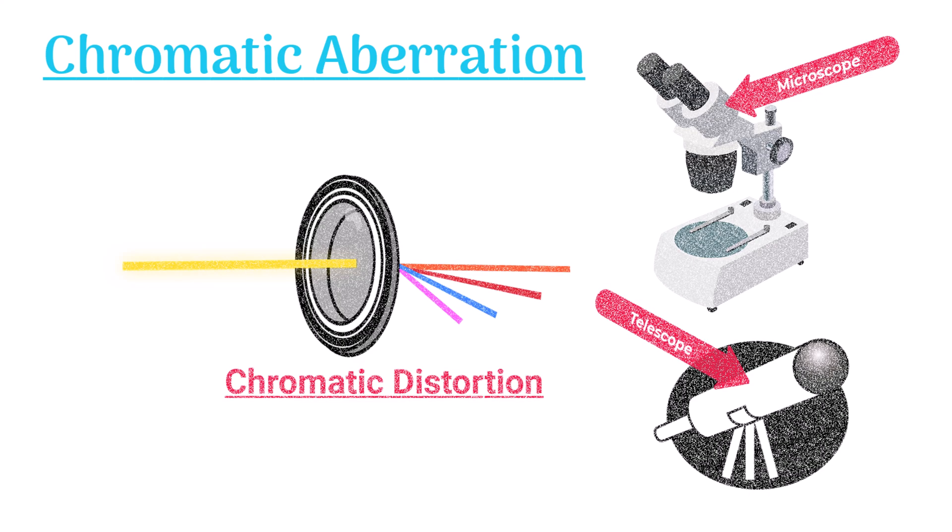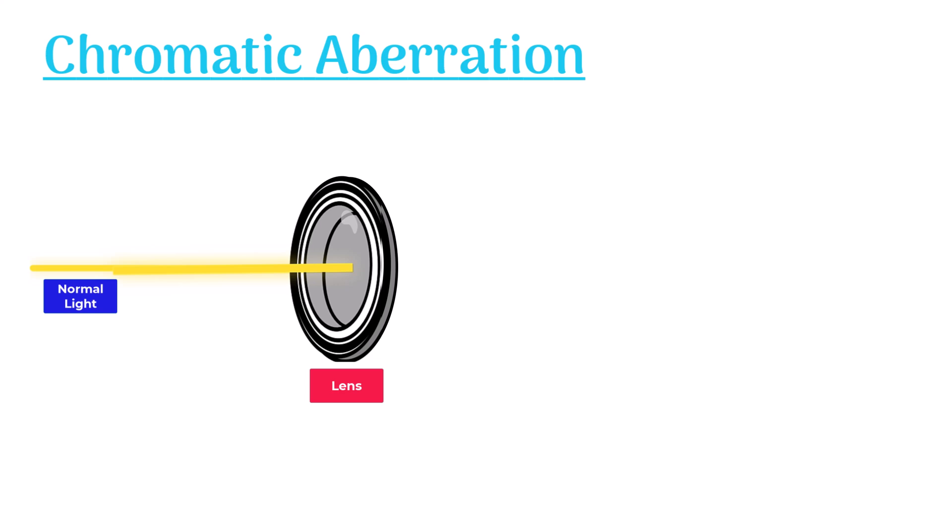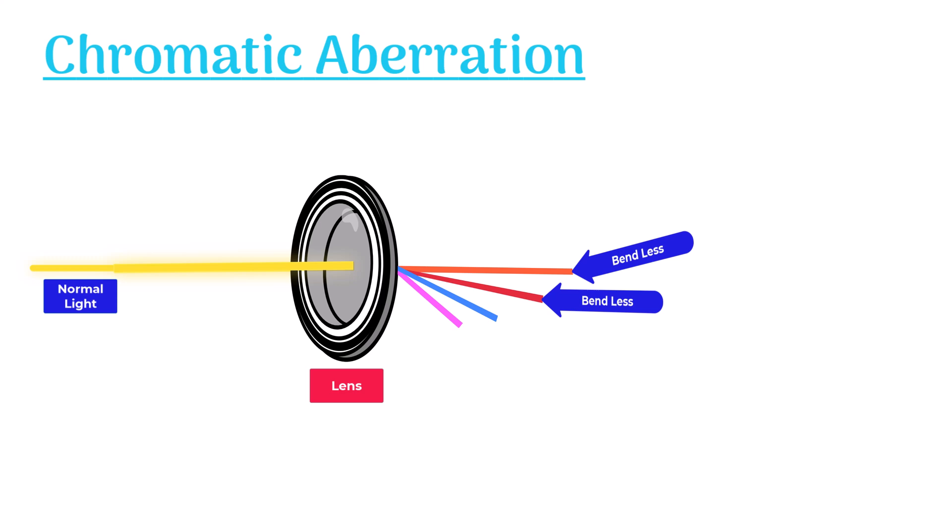This issue arises when normal light passes through a lens. The lens splits this light into different colors. The lens should focus all colors on a single focal point, but it fails because each color has a different wavelength. So some bend less and some bend more, thus they fall on different focal points.